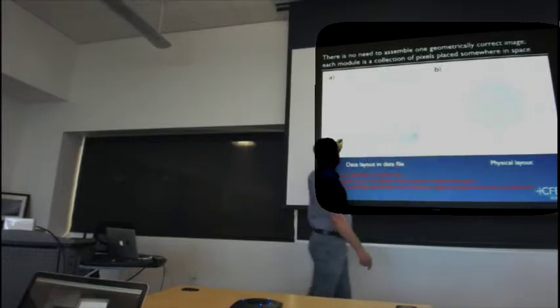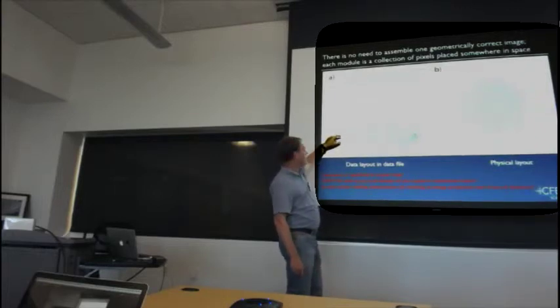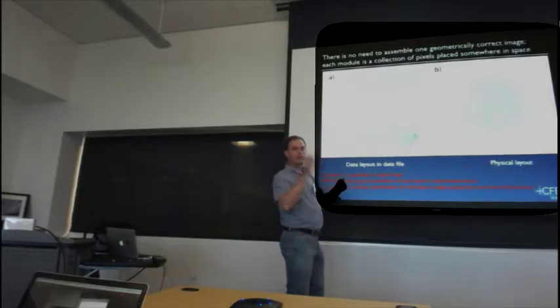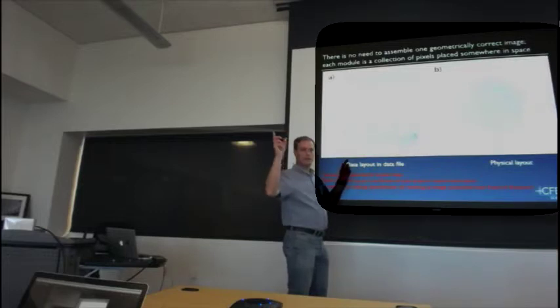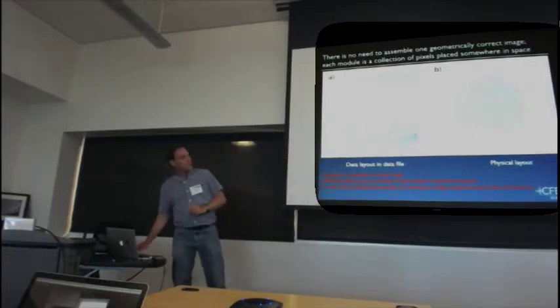In the same way, if you know there are Bragg peaks on pixel whatnot here, and you have a specification for where this is in space, all you do in your software, before sending it to MOSFLM, is remap to where these things are in space, and then do your auto-indexing for the geometry. So getting that right is fairly critical.